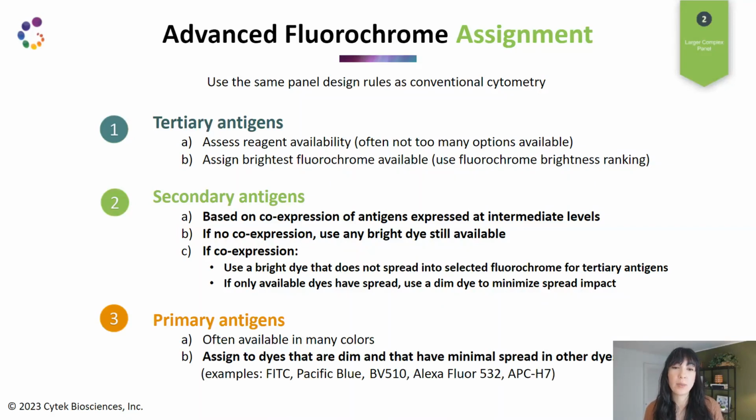And then finally, we have our primary antigens. This is where it's much more critical to pair these with dim fluorochromes. That is a strategy we use to minimize spread.